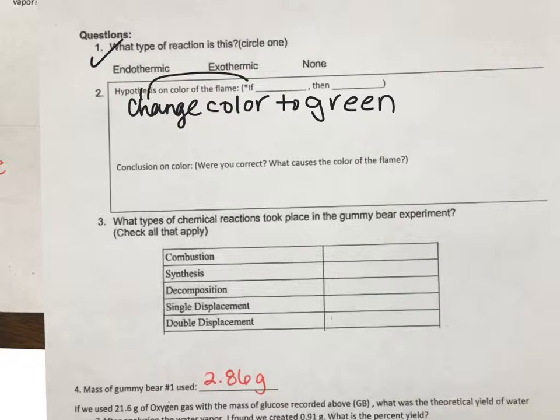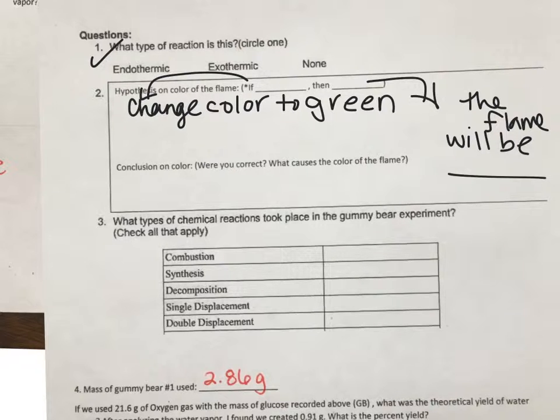then the flame will be, and you're going to go ahead and put a hypothesis. Do you think it'll change with the color of the gummy bear? Do you think it's going to stay the same? And finally, after the video, you're going to have your conclusion on the color, and I will add a little helpful hint to that one at the very, very end.